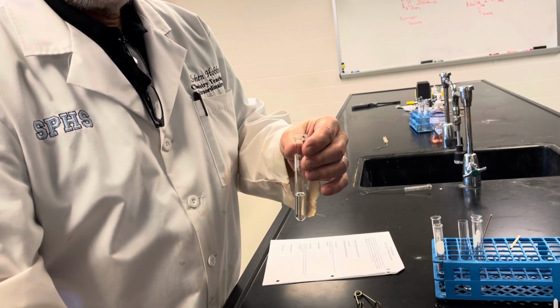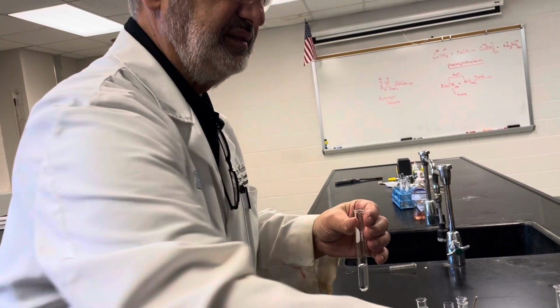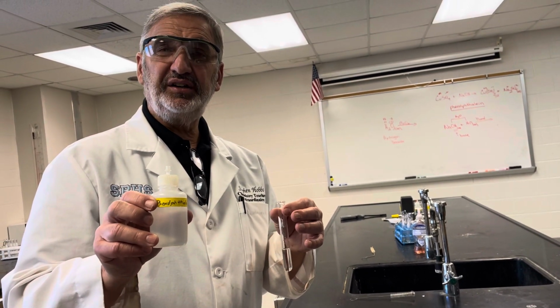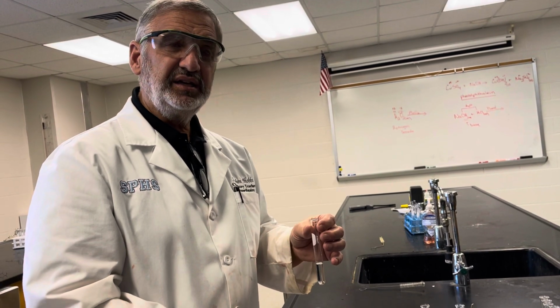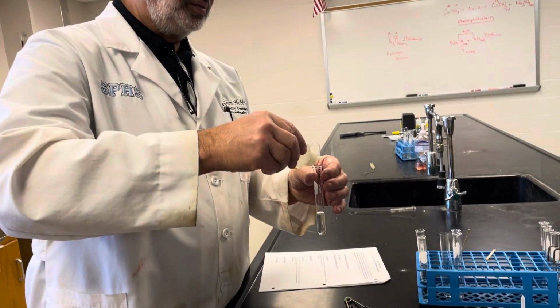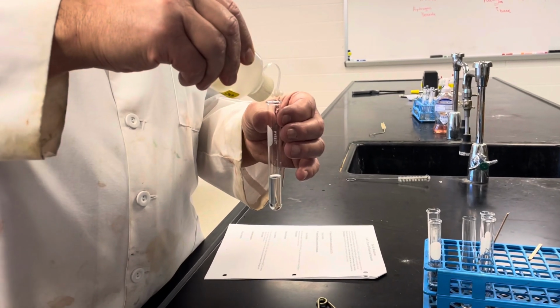And then I'm going to use this stuff called phenolphthalein. Now phenolphthalein is what we call an indicator. It changes color when it's in an acid or a base. And in an acid, I'm just going to use 2 or 3 drops. Well, 2 or 3 or none drops.